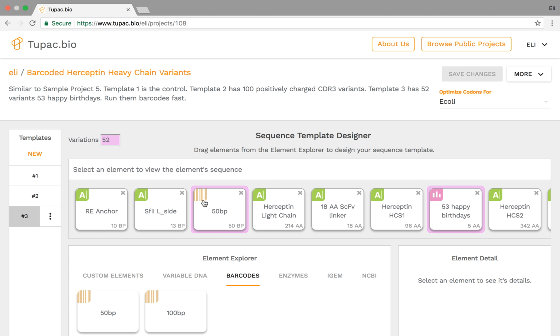And there's 2 goals I like to keep in mind when I decide where to place a DNA barcode element. And that's 1, place the element at a location that minimizes the effect on transcription and other biological processes. And 2, place the DNA barcode element at a location that minimizes the length of the entire design and therefore the synthetic DNA, and that's for practical reasons like cost.